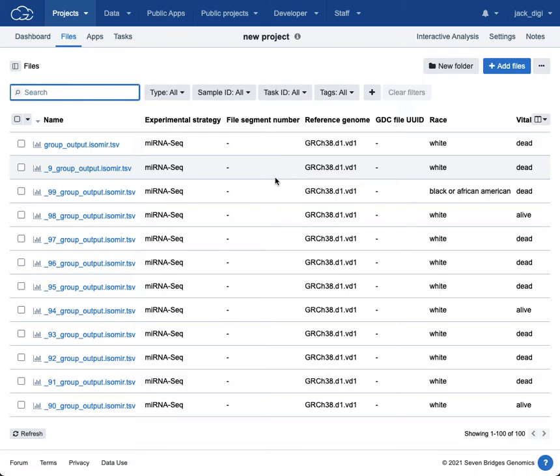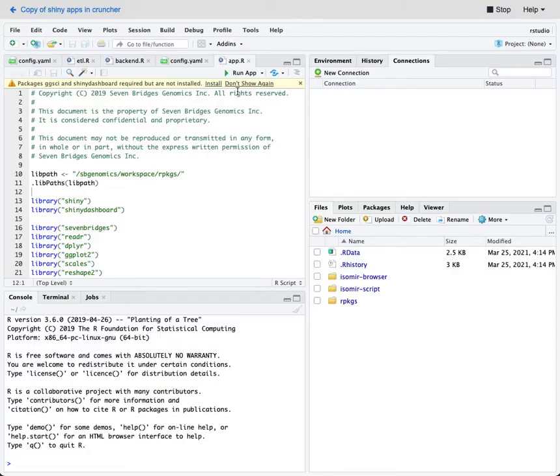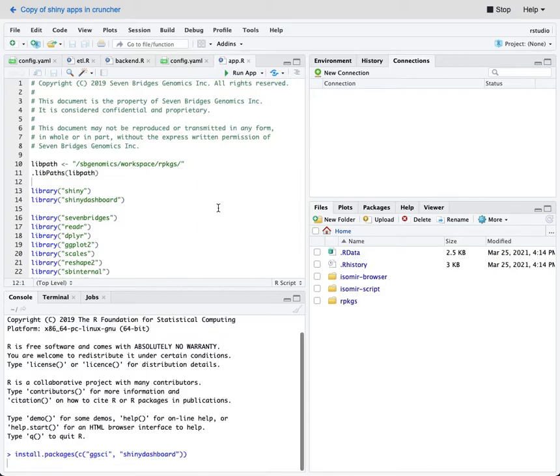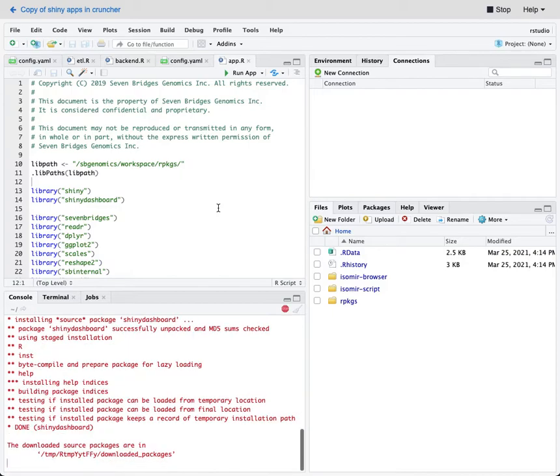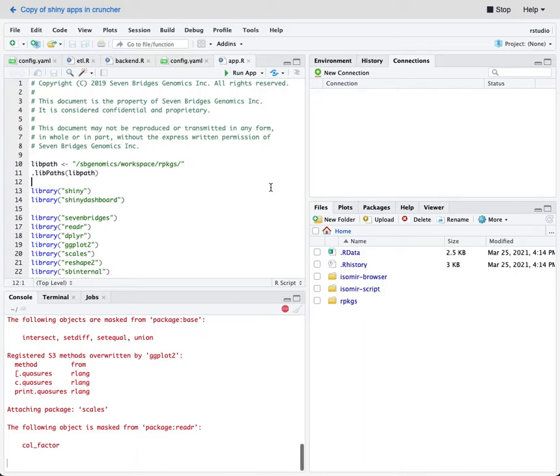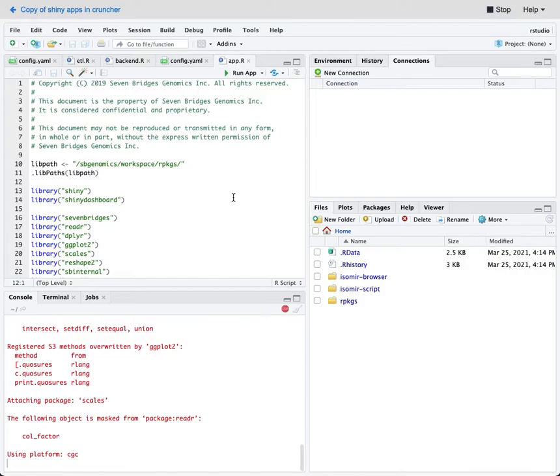So one thing you could do in this particular project is bring those together and use something like a Shiny app to make it more accessible to more people after that was run. So here I have an example of RStudio, which is in the project, and a Shiny app that was created on top of it. And if I run this app, it has access to all the things that are in the project, and it's a program that's going to organize that all together and create a visualization for it. And I'm just waiting for it to pop up here and making sure that my pop-up blocker doesn't get it.